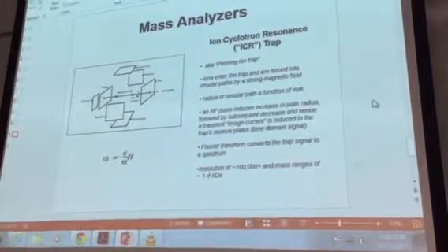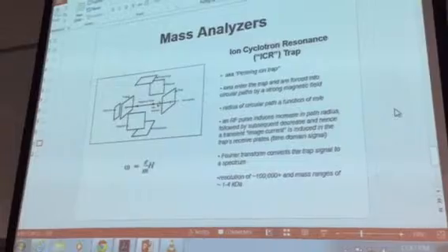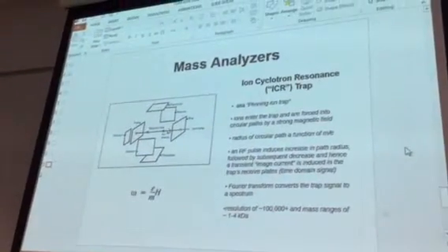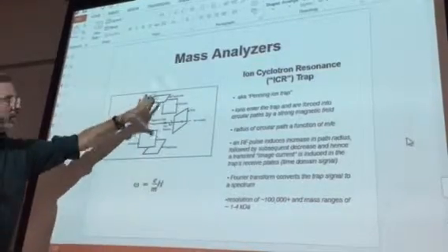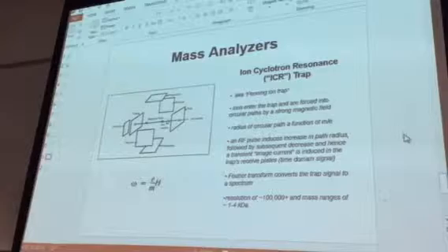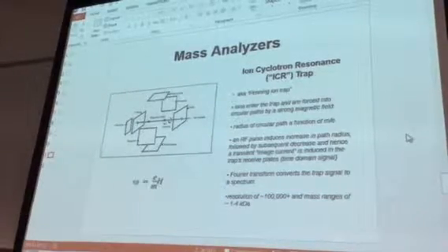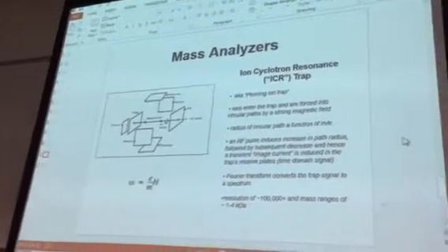So depending on the angular frequency of travel for that particular ion, which is a function of its mass to charge ratio, it'll generate an electromagnetic wave that can be detected by these receiver plates. It's a time domain signal, everyone. How the intensity varies with time is a function of the mass to charge ratio.